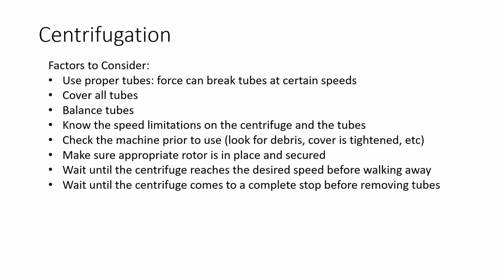Wait until a centrifuge reaches the desired speed before walking away. I've done this so many times where I put the tubes in there and then I walk away thinking that, oh, it started and it didn't get up to the appropriate speed because there was some type of error flag that read on the machine. It does take maybe a couple minutes or several seconds before it gets up to that appropriate speed. So you want to stand there and watch and make sure that there's no errors. Once it's at the speed that it should be at to perform the centrifugation that you requested the machine, it's pretty safe. You can walk away at that time, but making sure it gets up to speed before walking away will save you some additional frustrations down the road.